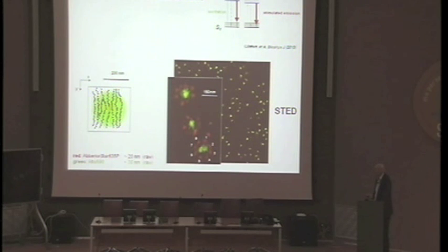Well, another advantage of this method, so some of you will, of course, be interested. What is the particular advantage here of this method called STED? Is that you get perfect colocalization, especially if you use a single donut beam, a single ring-shaped beam for turning off the molecules. And that's what we recommend. That's what we usually do.